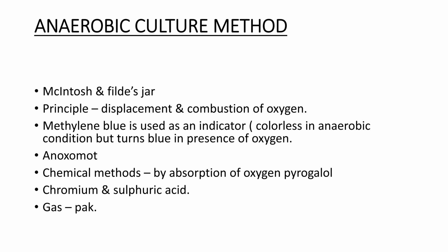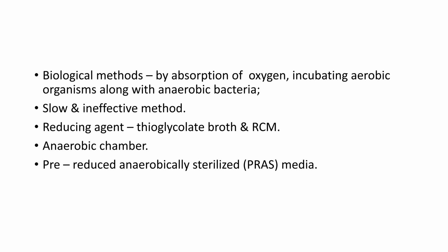Next method is the chemical method, for example, by absorption of oxygen by pyrogallol, and chromium and sulfuric acid, and the gas pak method. The other methods are the biological methods, in which the absorption of oxygen occurs by incubating aerobic organisms along with the anaerobic bacteria, and it is a slow and ineffective method. The reducing agent in it is thioglycolate broth, and basically the RCM, that is the Robertson cooked meat media.